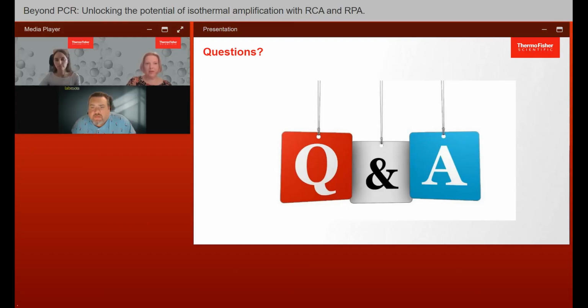But LAMP, for example, with 6 primers and quite high temperature, if well designed, can be really specific. RPA primers are also longer, as for PCR, so this allows to have similar specificity as in PCR. Also, it can be increased by combining with CRISPR-Cas systems and similar helpers.